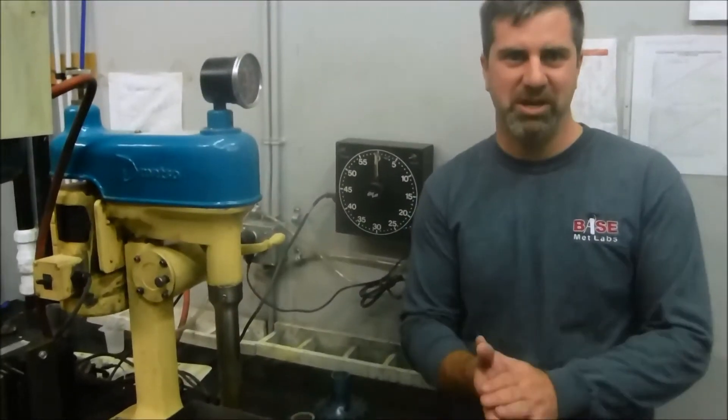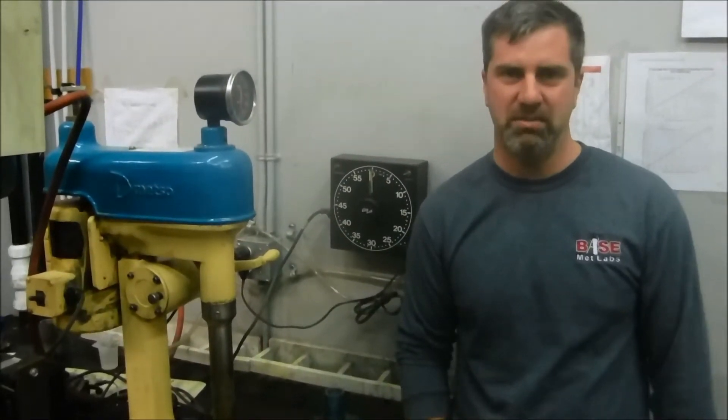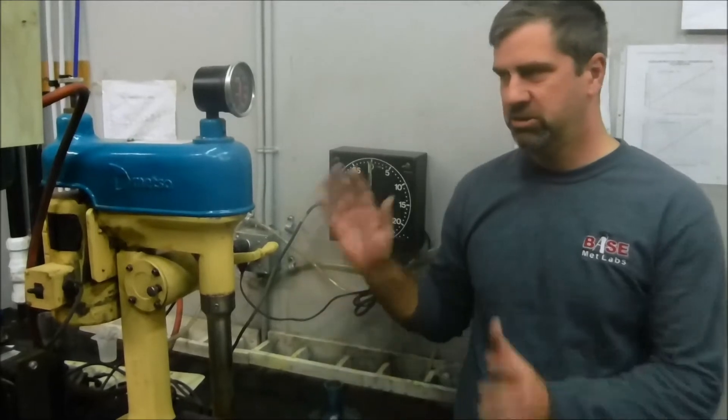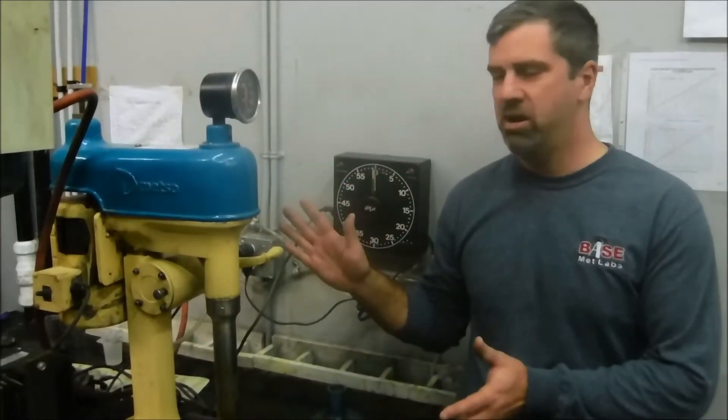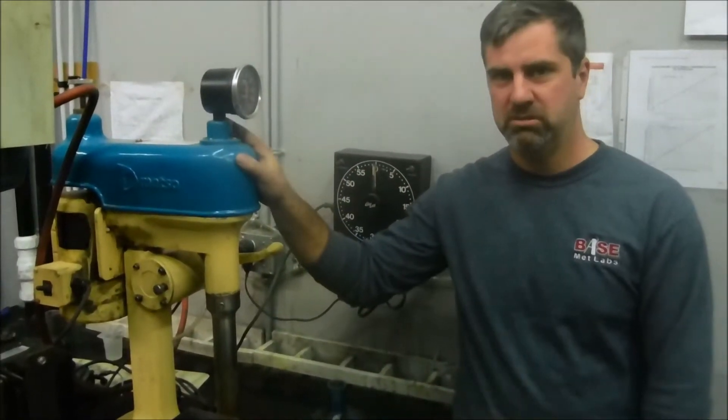Hi, my name is Tom Shodice. I'm with Base Met Labs. I'm a senior metallurgist here. I'm just going to do a quick product review on the Metso D12.